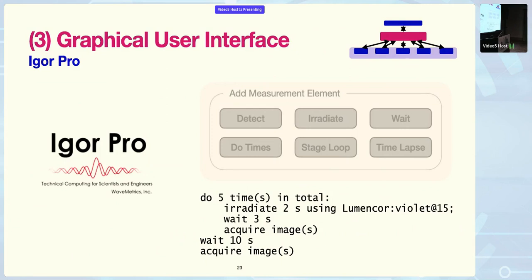They also see them being built, and by using these buttons, we make sure that the users, who are not programmers, they are biologists or biochemists, always construct syntactically well-formed programs. The only thing that they do have to know is a notion of indentation, so that the program will do as they expect to make well-behaving programs.